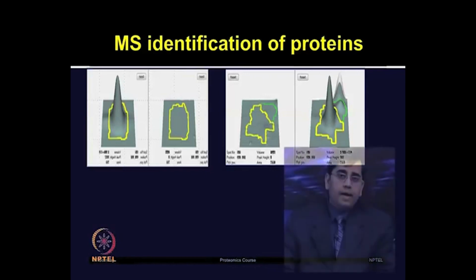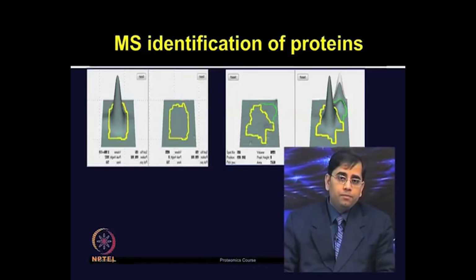After the identity of these proteins was established, there were 7 proteins which were not detectable in the healthy controls and only observed in the SARS patients. The identities of those included glutathione peroxidase, PRX2, retinol binding protein, vitamin D binding protein and serum amyloid A proteins.